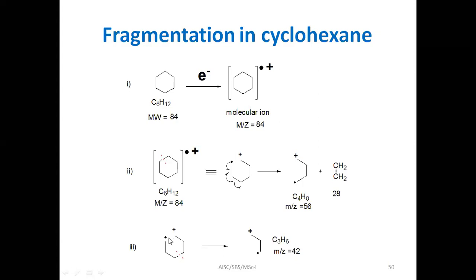One can show it directly here, making a cyclopropane-type compound like in photochemistry, with this dot plus on one fragment. So those having positive charge, with dot or without dot, are detected in the mass spectrum. So they are showing a peak at m by z 42.